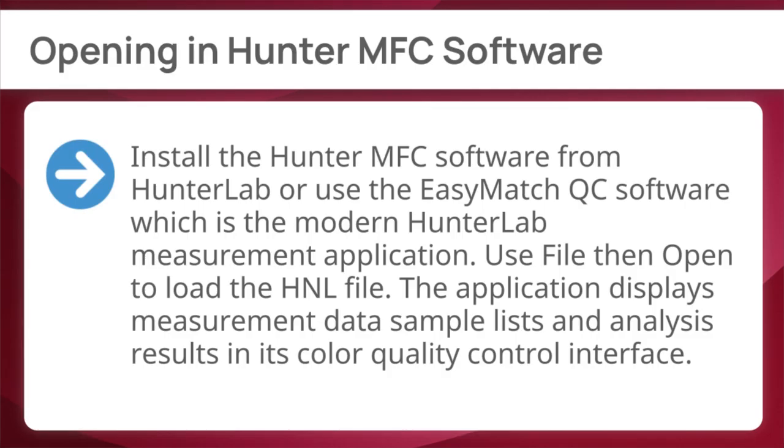Install the Hunter MFC software from HunterLab, or use the Easy Match QC software, which is the modern HunterLab measurement application. Use File then Open to load the HNL file. The application displays measurement data, sample lists, and analysis results in its color quality control interface.